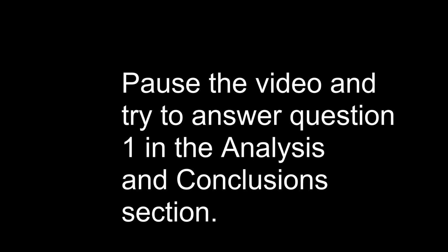So I have the sheet in front of me with the questions, as I'm sure you are looking at yours, maybe online. We're going to answer questions 1 through 4 together. That way, if you have any confusion, hopefully this can help you. All right, so number 1, it says, what is the largest volume of liquid that the graduated cylinder is able to measure?